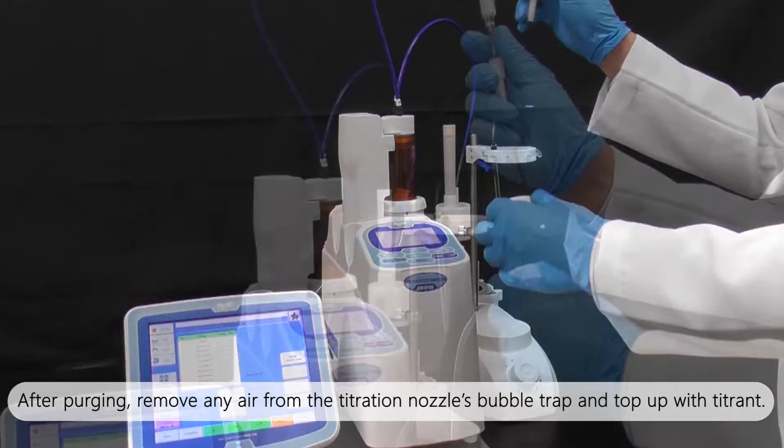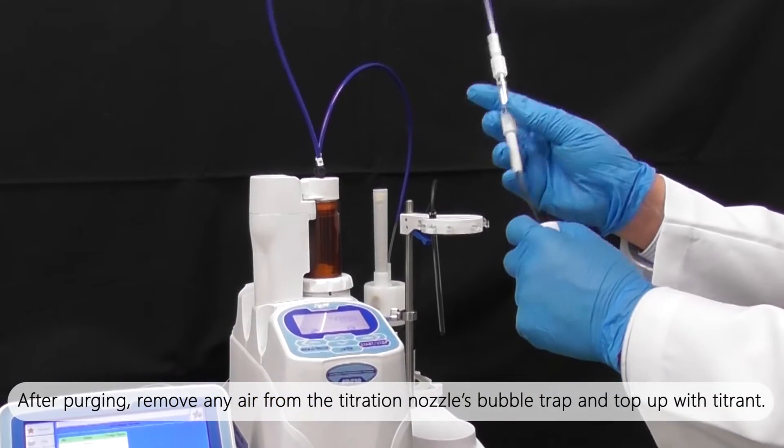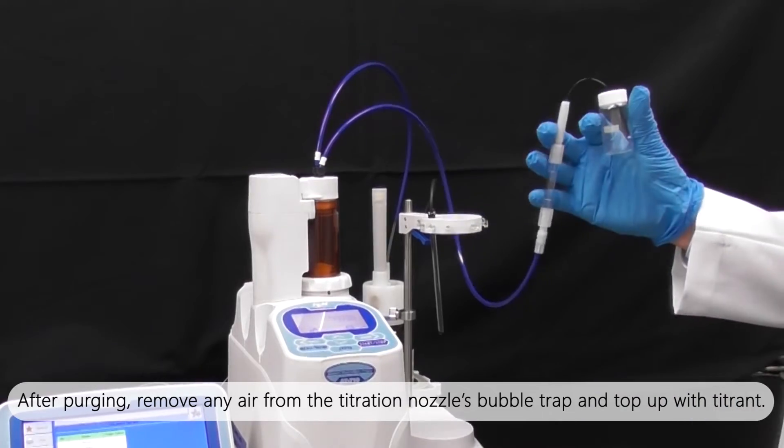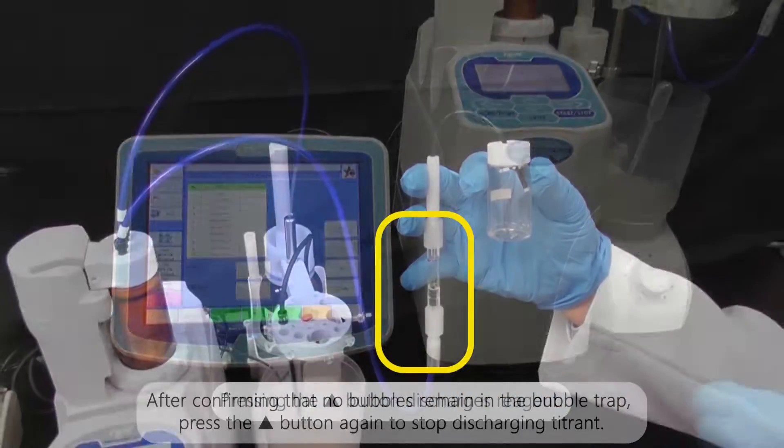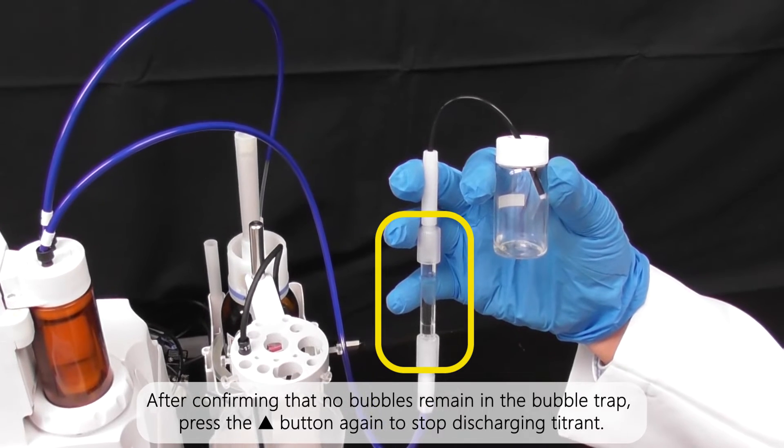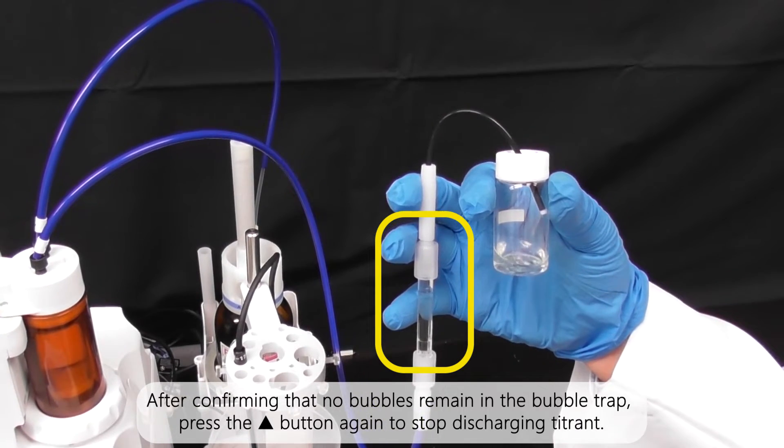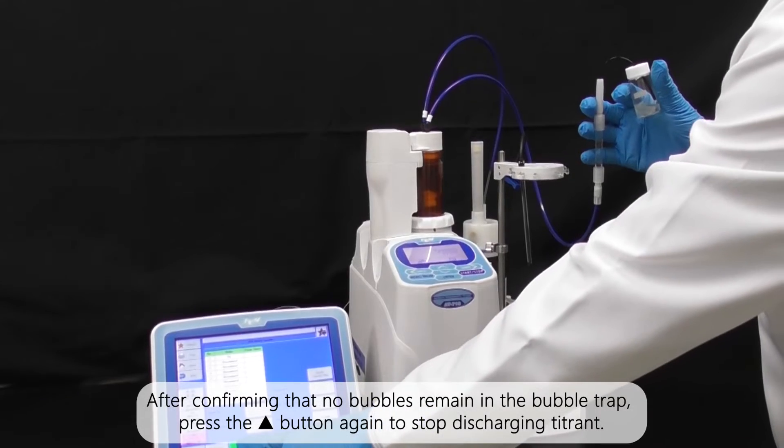After purging, remove any air from the titration nozzle's bubble trap and top up with titrant. Pressing the up button discharges reagent. After confirming that no bubbles remain in the bubble trap, press the up button again to stop discharging titrant.